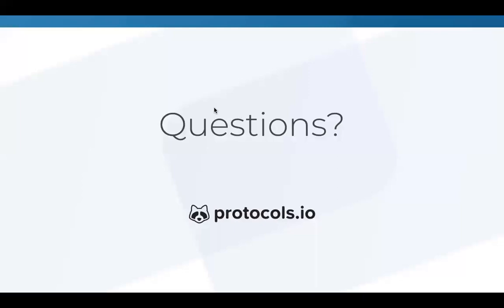And then there's another question: how widely is protocols.io used for computational biology workflows? There are a bunch of people using it already, and it's very exciting. Of course, we always welcome more, but there are a lot of people already using it for computational workflows. I can also share more examples of that afterwards, if you're interested.